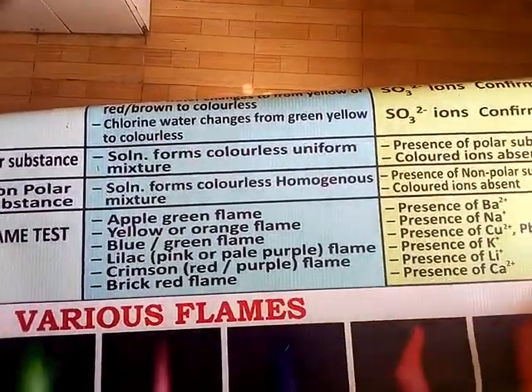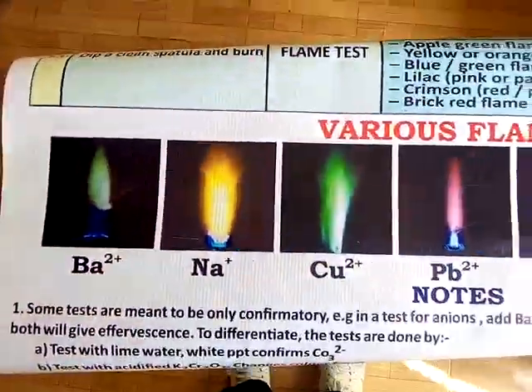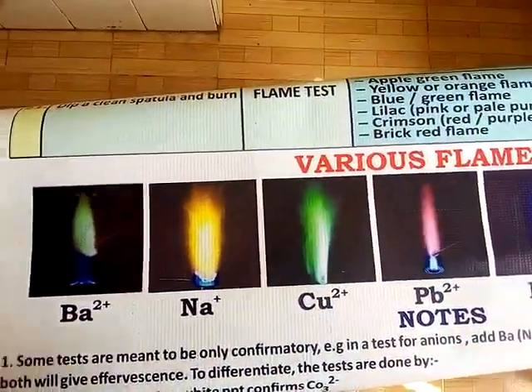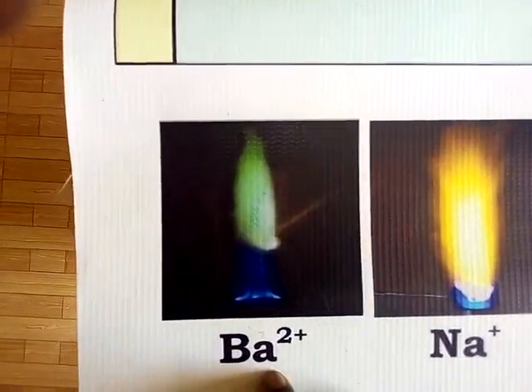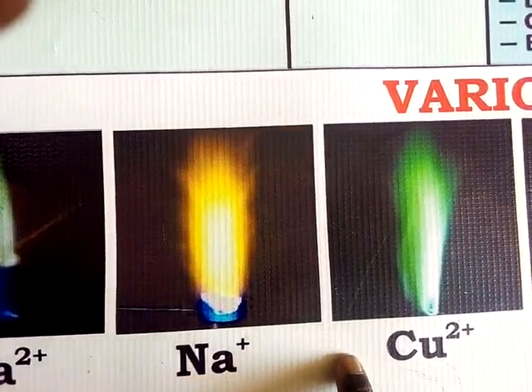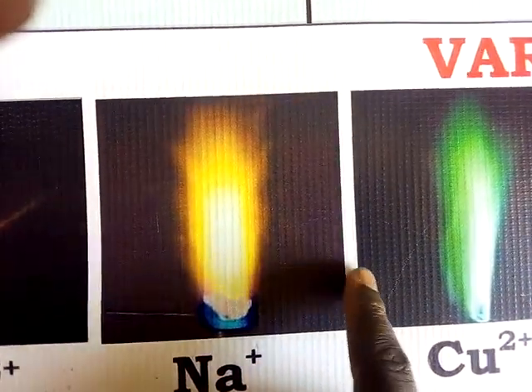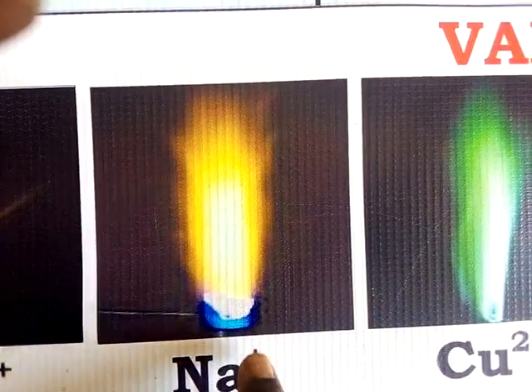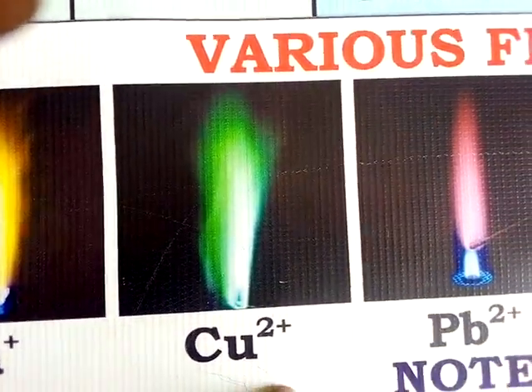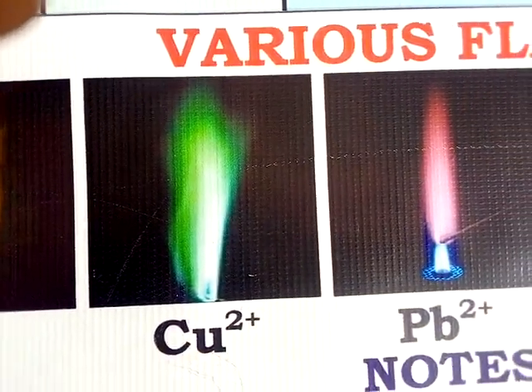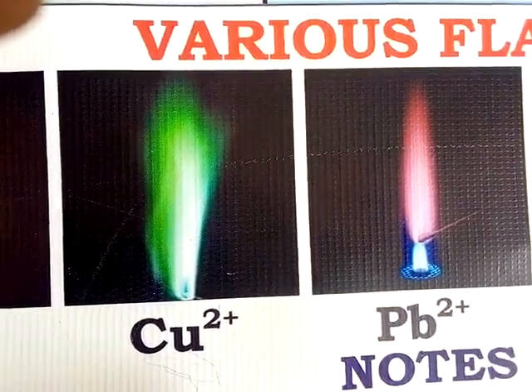Let me show you the various colors. Now look at barium — that is the color of barium. Sodium: that is how it will burn, you can see it is very yellow. What about copper ions? Copper ions will burn like that, and that is the flame you will see, and then in the inference you will write copper ions.